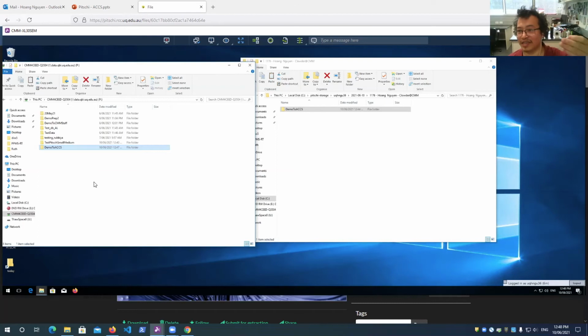If the user logs in, the standard, I'm not sure whether you are using PPMS tracker, James. I write my own because theirs is very limited in what it can do. You can only enable or disable whether you need a booking or not, that you belong to the same group and things like that. So we've written our own to handle those sort of situations. And we also have individual login into the PC rather than admin log into the PC and then use the tracker to block the screen, so that you actually log in for each user and track for that, and then you shut down the computer when you're done. So we can't shut down the computer on our systems. Basically, that's the issue.